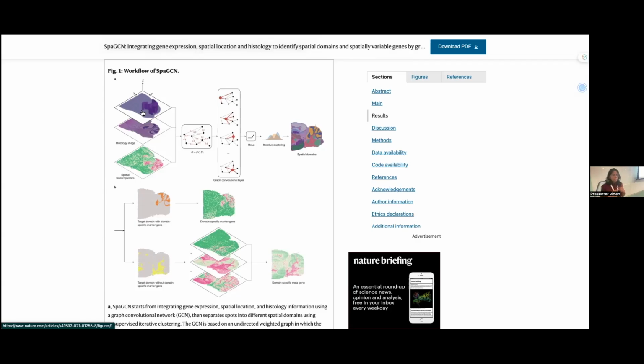The principle behind this is that if all my cells have similar gene expression, but their RGB profile is different, it means that I am looking at some sort of dissimilarity, as compared to a region where my RGB values and my gene expression values are concordant with each other.